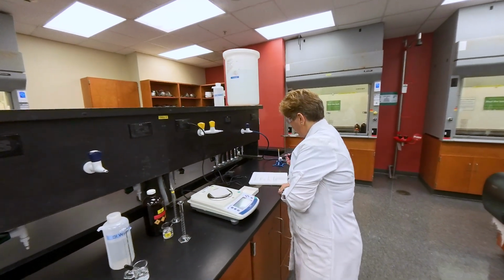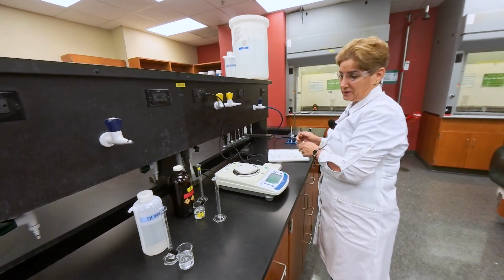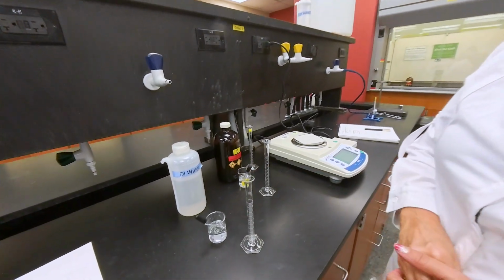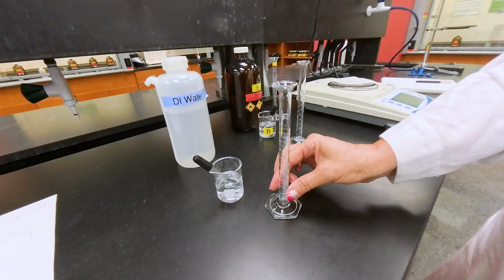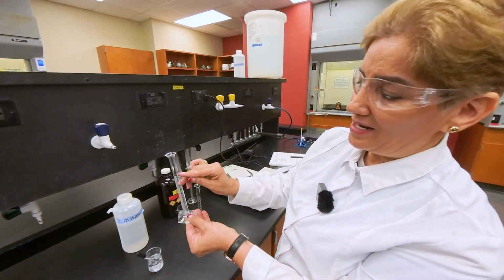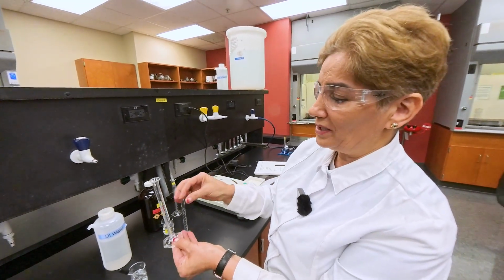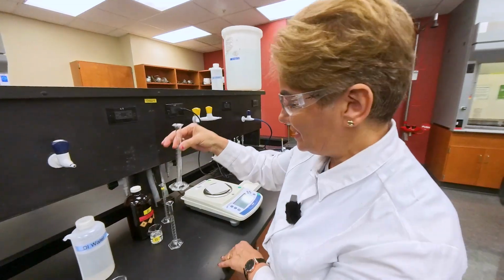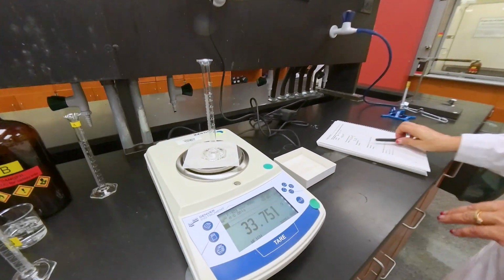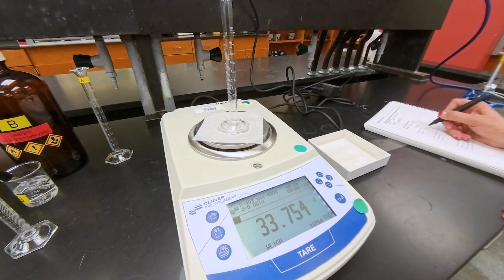Next, we are going to measure the density of water. For the density of the water, I need the mass and the volume. So I'm going to use a graduated cylinder, fill it up to exactly 10 milliliters, and then measure the mass. But because I want the mass of the liquid, I need the mass of the container first. So I place the graduated cylinder on the scale. You measure the mass of the empty graduated cylinder first.